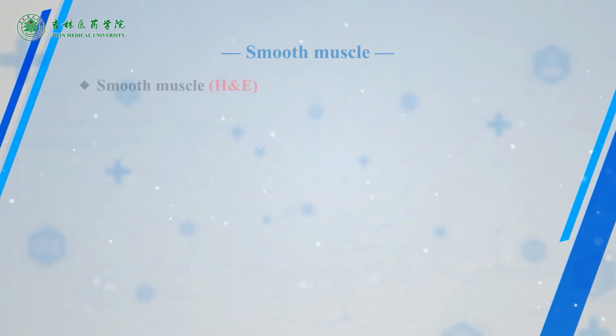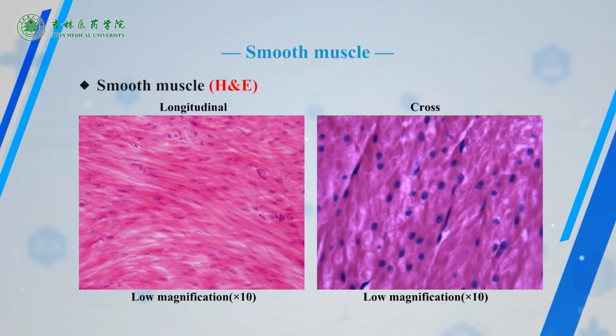The last slide, smooth muscle. Smooth muscle is found in the wall of the hollow internal organ, such as blood vessel, bladder, and uterus. Longitudinal and cross-section profiles of smooth muscle cells show their characteristic appearance. Smooth muscle is composed of spindle-shaped cells.